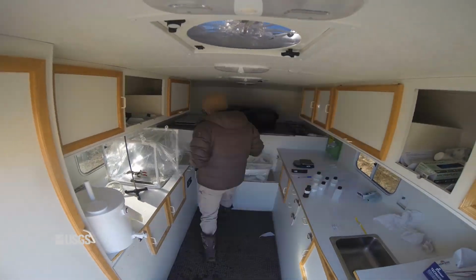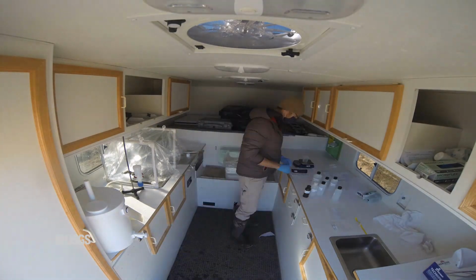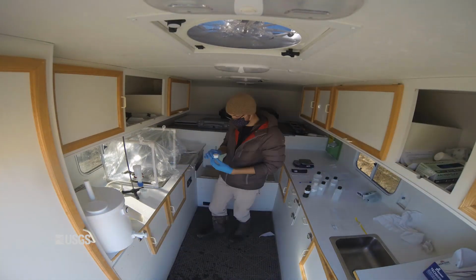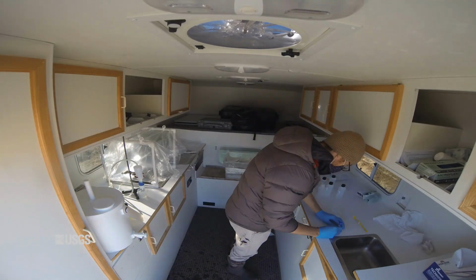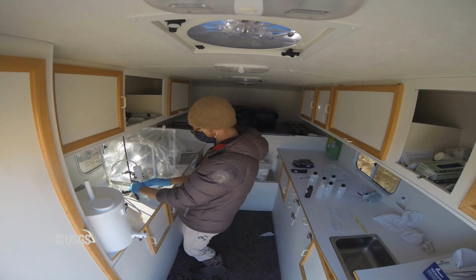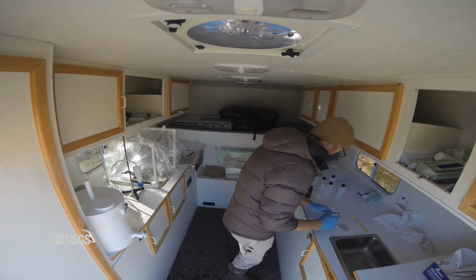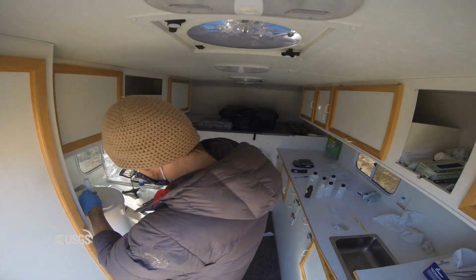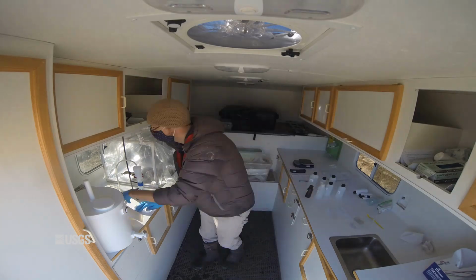Here's a time lapse of us sampling, collecting raw samples from the churn, then setting up my TPCN, which is total particulate carbon and nitrogen. We run the raw sample through a filter, collect particulate, and then the lab analyzes the filter. We do 3 of these, just for consistency. You see I change my gloves a lot. Clean hands are super important.